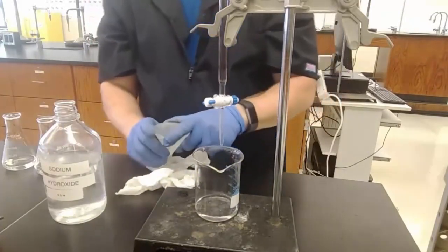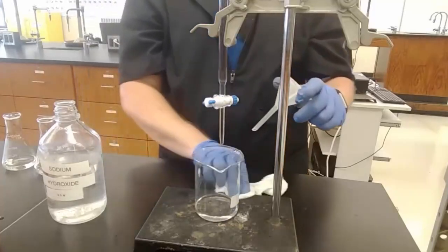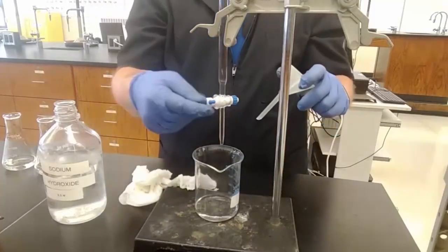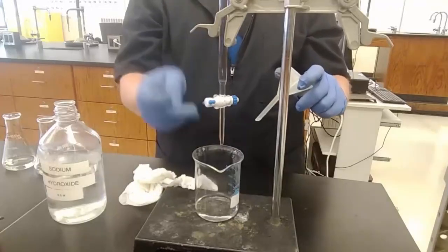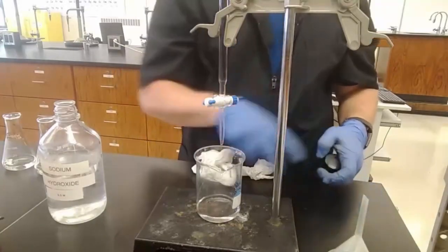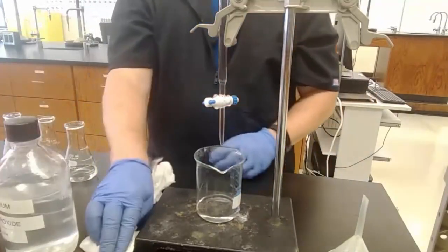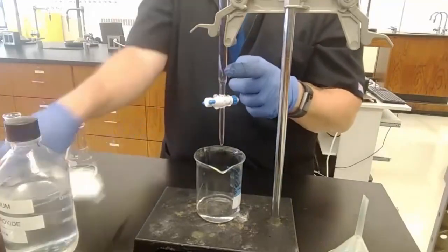Because if there were air in the tip, then when I turn the valve on, some of it will be filling the tip, not draining into my reaction. So I need to make sure that I don't waste the function of the burette.